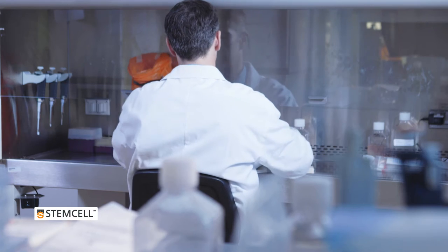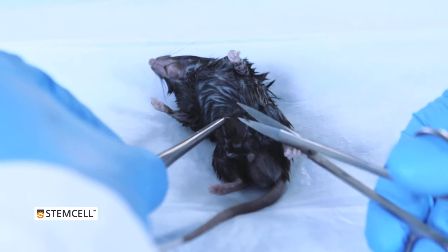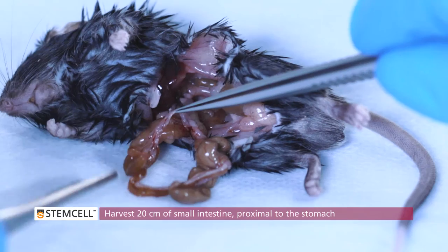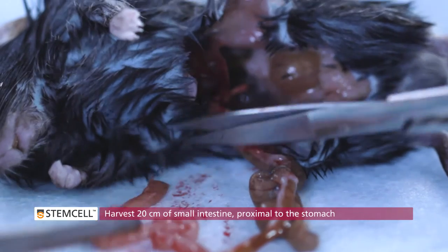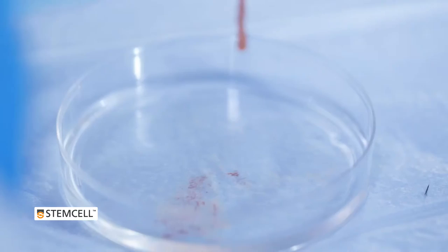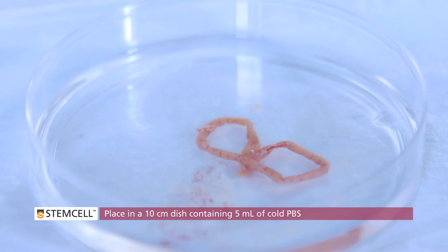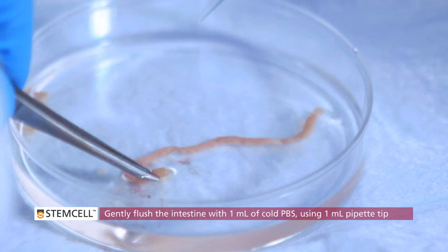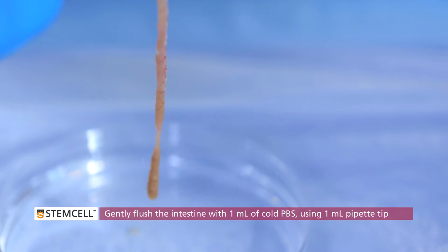Sacrifice a mouse according to applicable ethical regulations and harvest 20 cm of small intestine, proximal to the stomach. Place the harvested intestine in a 10 cm dish containing 5 mL of cold PBS. Gently flush the intestine with 1 mL of cold PBS by inserting a 1 mL pipette tip into one end of the tube.